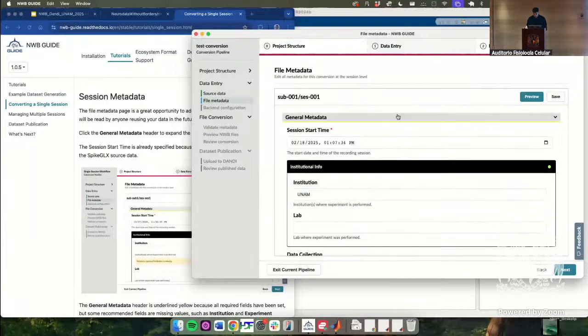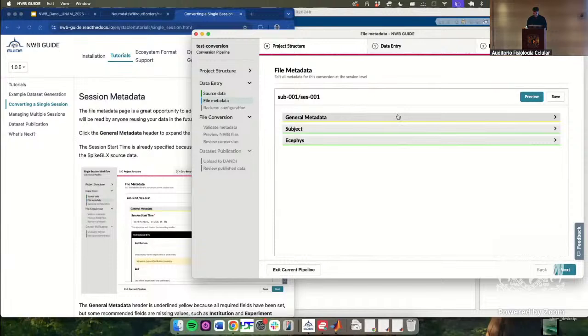So the original data you uploaded is in any sort of format? So this is taking data that's stored locally on my computer and converting it to NWB so that I can upload it to DANDI. And that data was, for example, an Excel sheet? The data is what would come out of the most common standard Neuropixels acquisition system. So SpikeGLX data is voltage over time data in binary format, not in Excel.